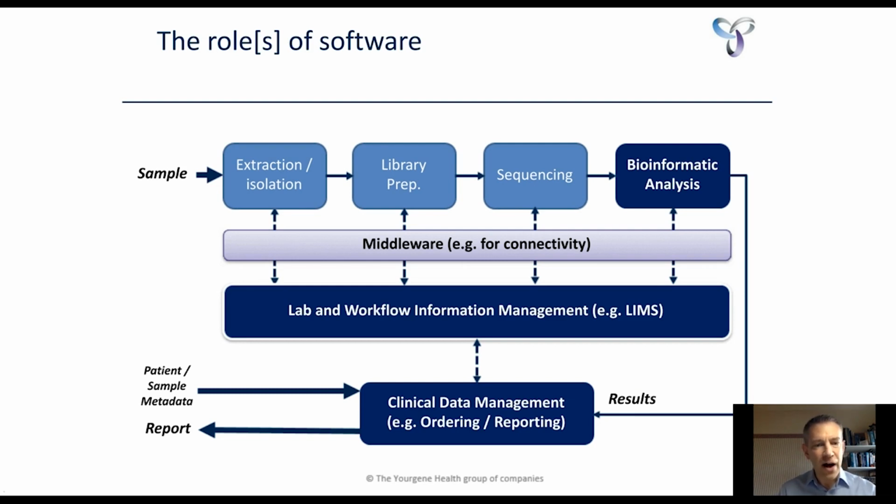Also, and I've shown these things in dark blue on this slide, we have a lab and workflow information management system, which cuts right across the whole workflow, including the analysis section. So that integrates all of the instruments, handles all the data flows, and provides tracking for samples, and also things like business reporting and monitoring functions.